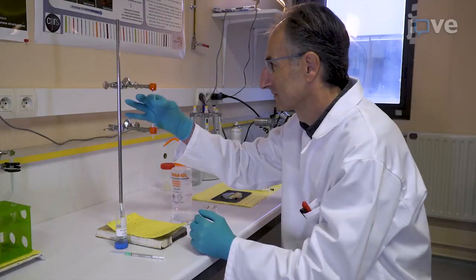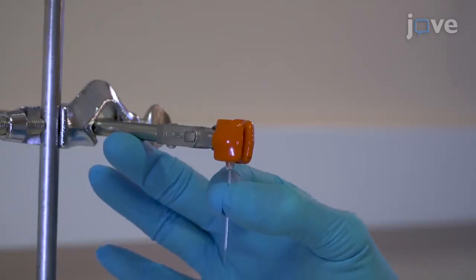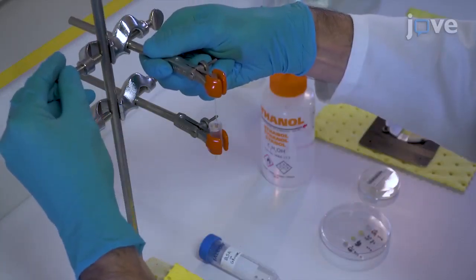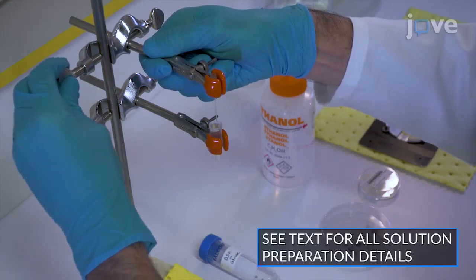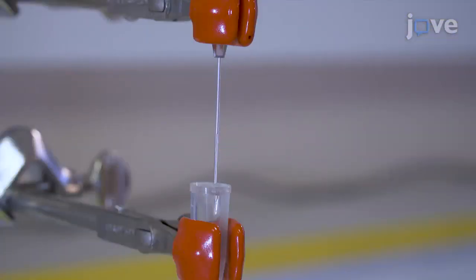Before beginning the procedure, place pulled glass micropipette capillaries vertically into holders and lower the holders until the tips are immersed in freshly prepared glucose bovine serum albumin solution overnight. By the next morning, the solution should have risen about one centimeter into the tips by capillary action.